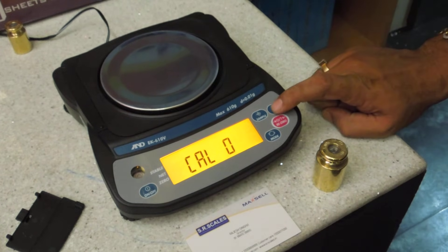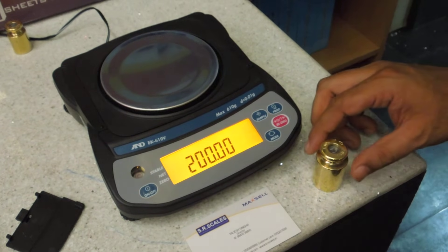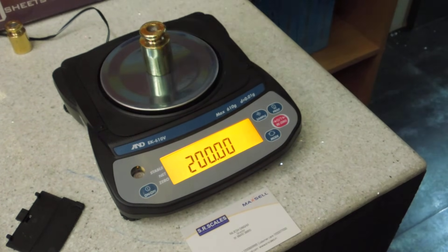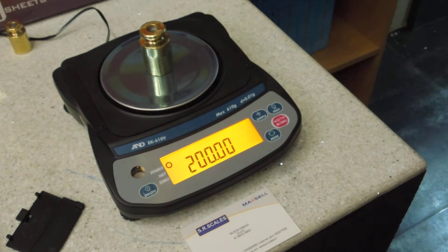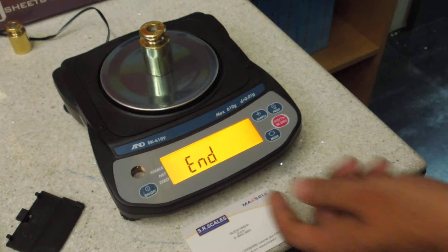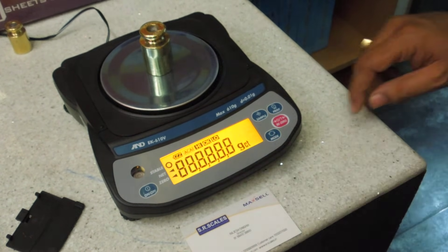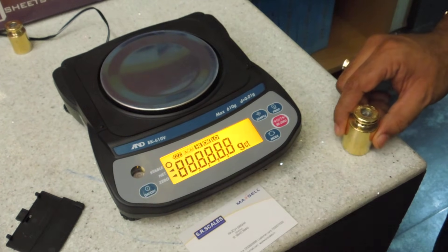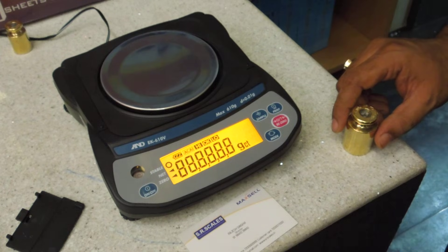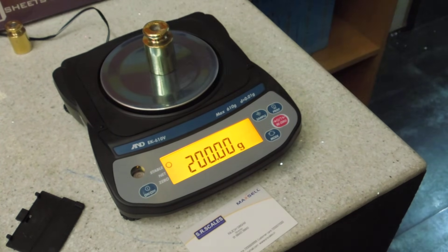Now press the print key, then place the 200 gram mass weight. Again press print, then press the program button. It's done.